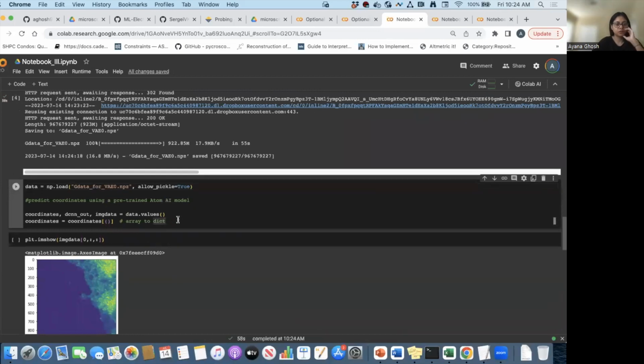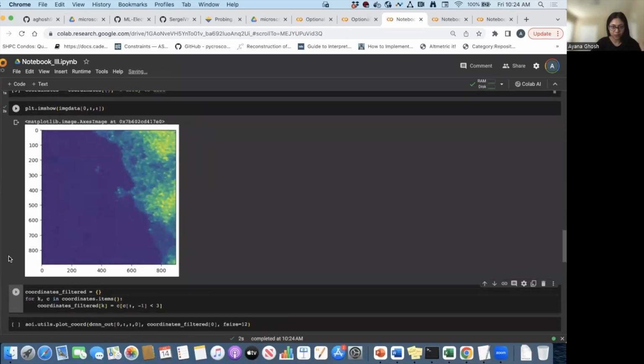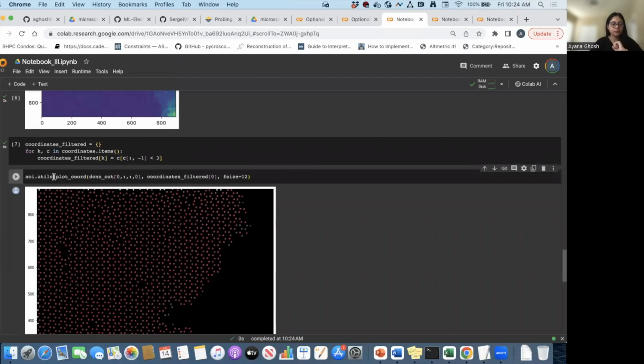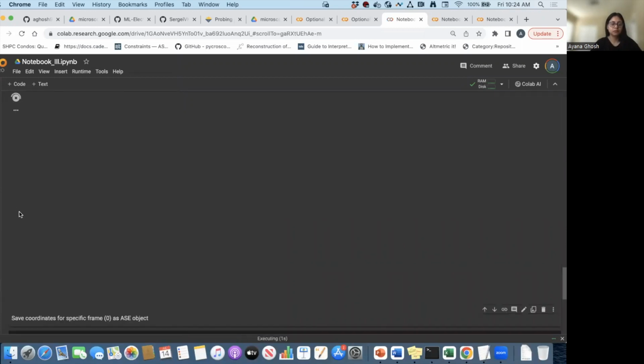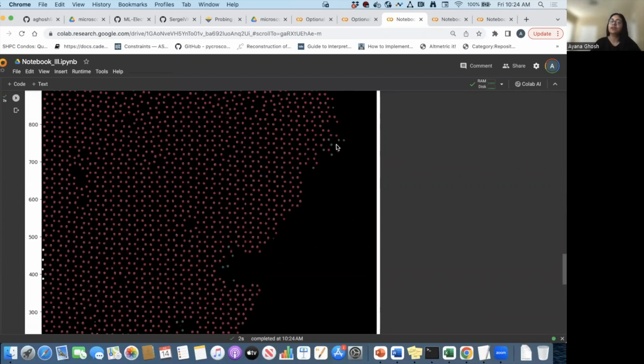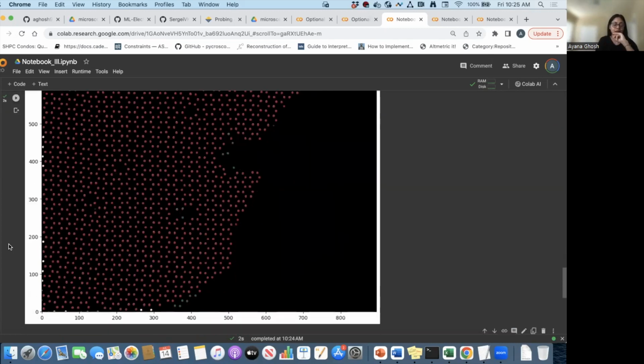Okay. So as I mentioned, you have access to the image data, you have access to the network outputs, and then the associated coordinates. So let's just do a sanity check. That's exactly what we have been seeing, that data, and then the coordinates. Let's plot that. Okay. So you can see that there are a little bit of defects there. Those were identified in the next set of that elite with the multi-class segmented model.